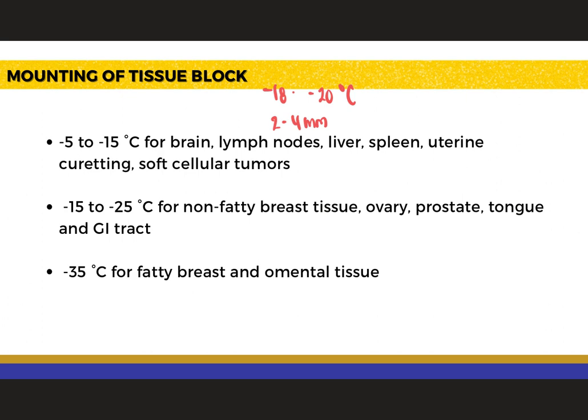Another important point to remember is mounting cryostat sections.